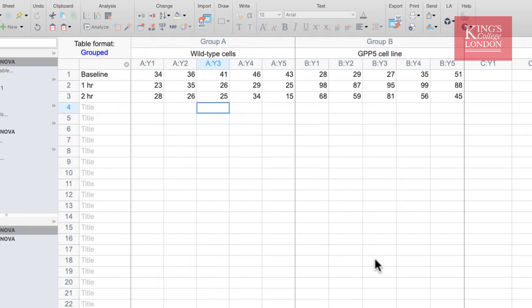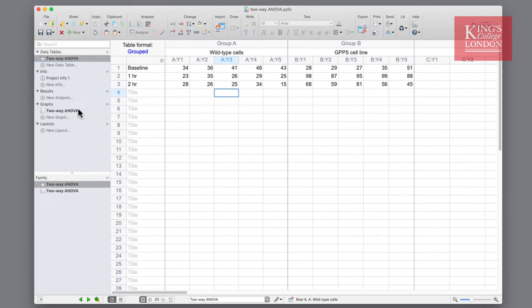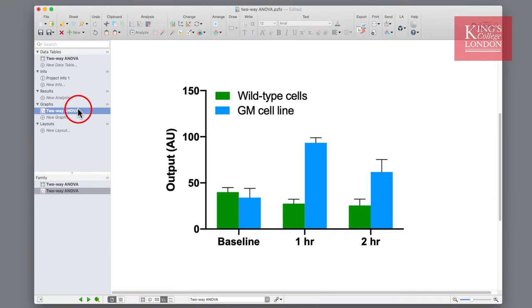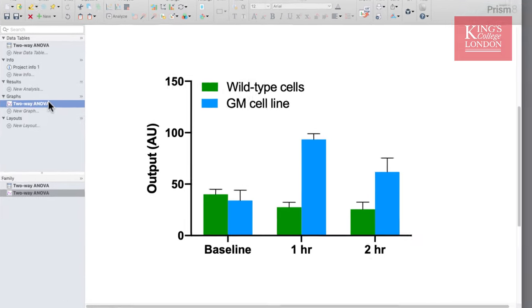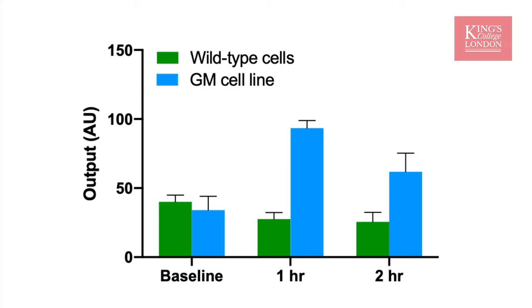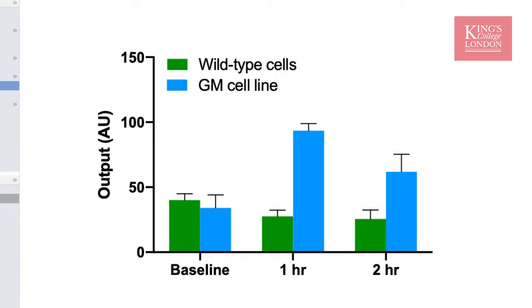We can plot these graphs — in fact Prism plots them automatically for us in the graphs tab of the navigation panel. Looking at the graph objectively, one might suggest that the genetically modified cell line has a bigger response at one and two hours compared to the wild type cells. Therefore we would test this using a two-way ANOVA.